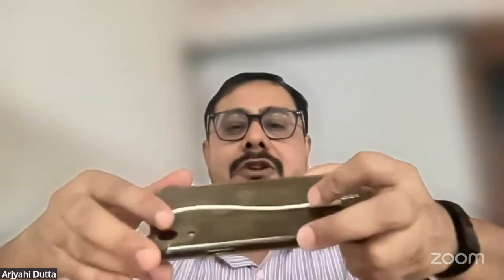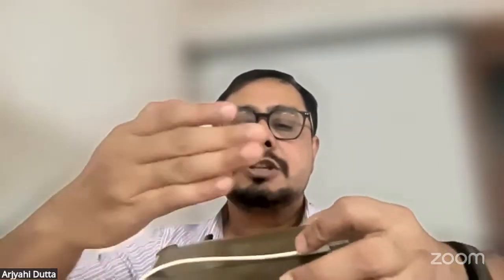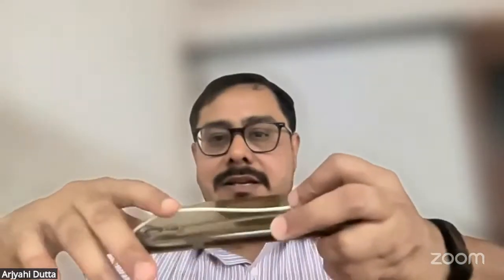I think maybe my video is not that clear. So here you can see this is one side, that is the other side. So the metal will just deposit on one particular side, not both sides. Okay. Uh, I was just wondering, how exactly does this produce better contrast? Because one side is shadowed and the other is not, we are able to see the DNA, and negative staining cannot give us that same result?